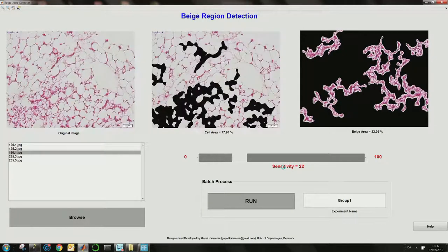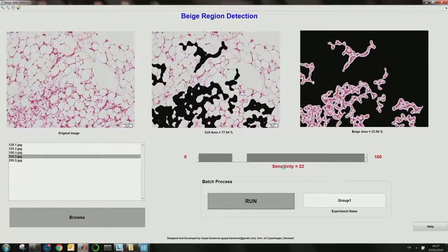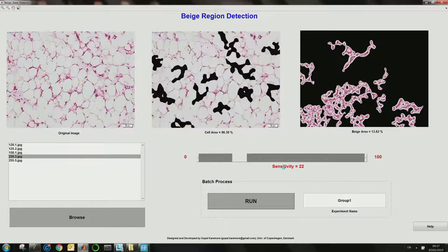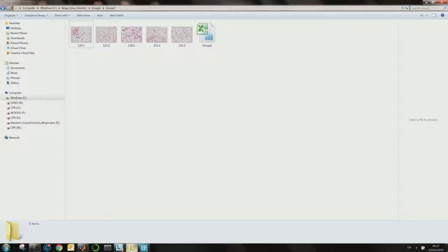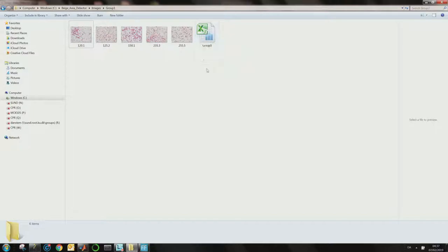Let's wait for it to finish. As you can see, a group one XLS file will be generated with the results.